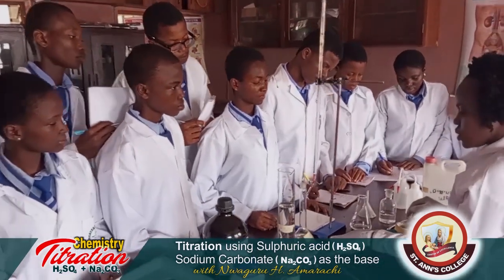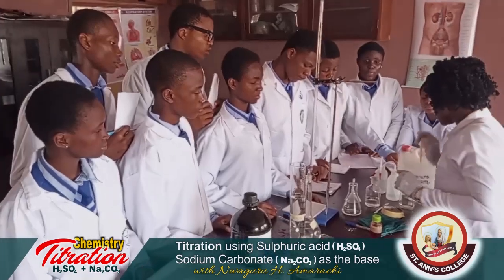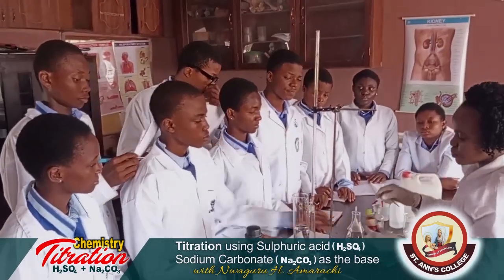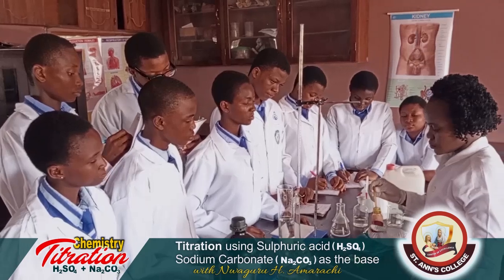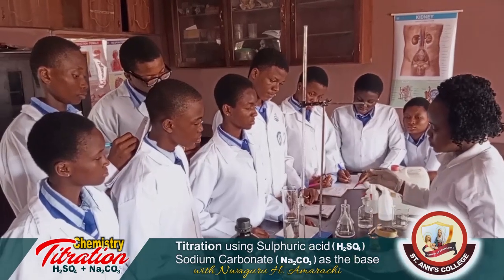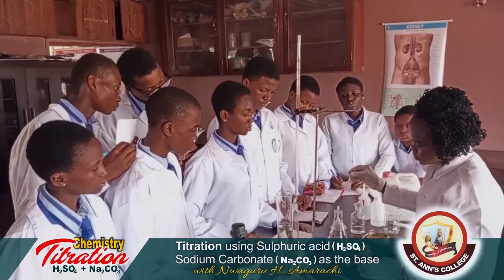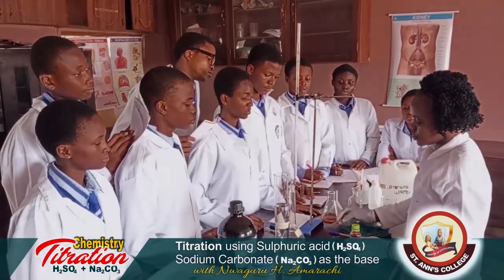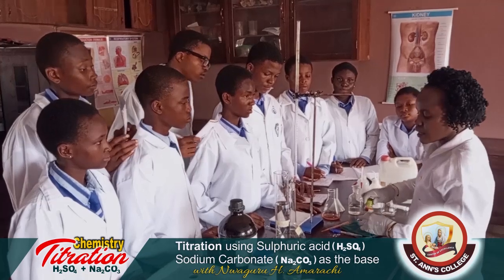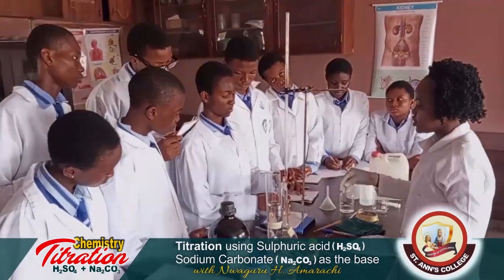Now, we are going to add our indicator, which is methyl orange. We're going to use 2 drops, a maximum of 2 drops of what? Methyl orange to enable us get the endpoint of the neutralization. Shake.